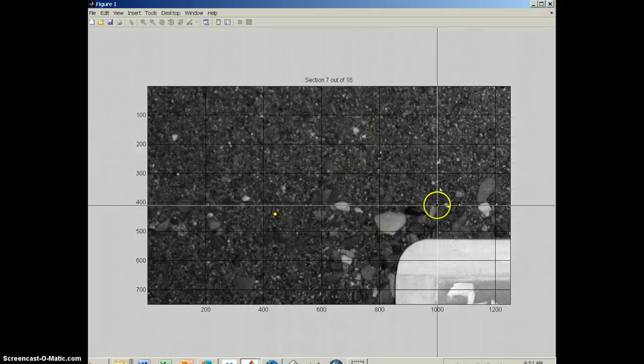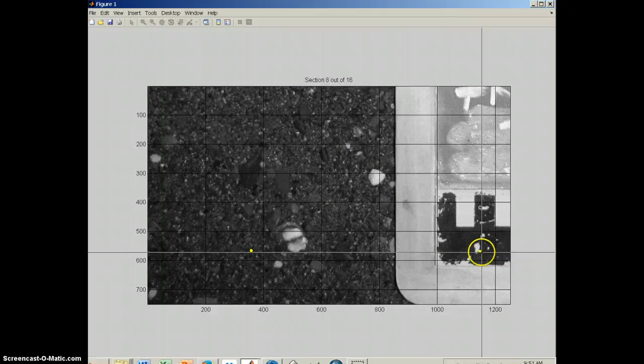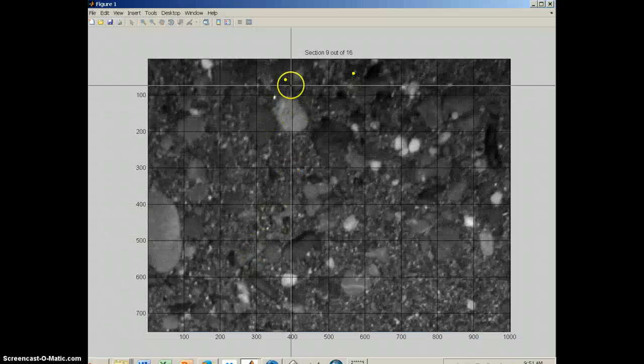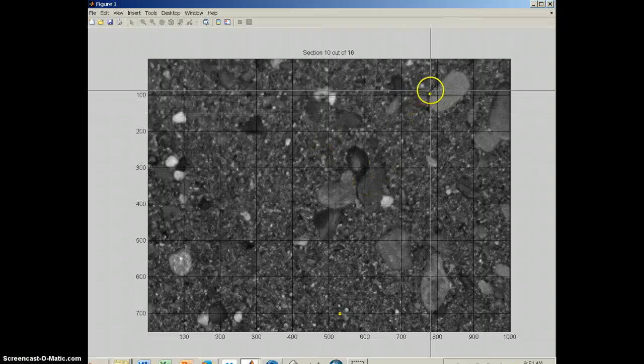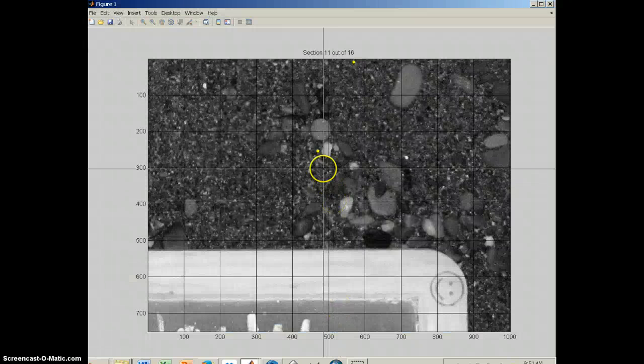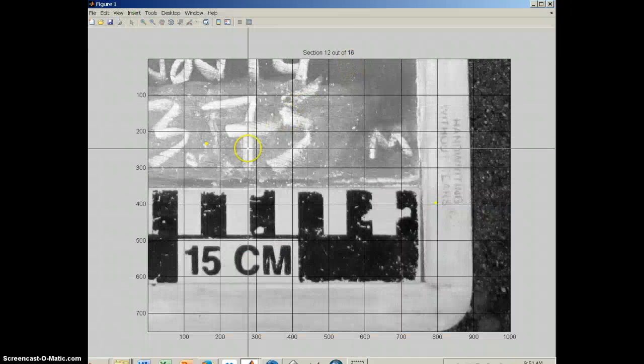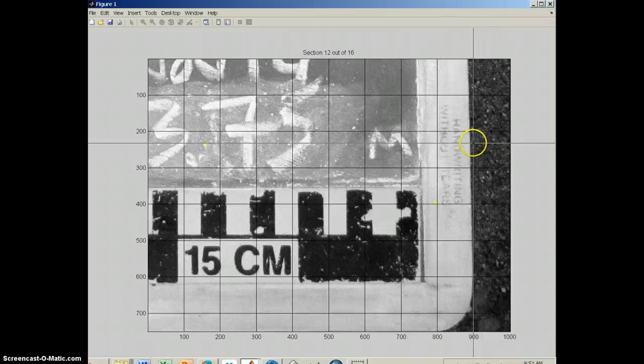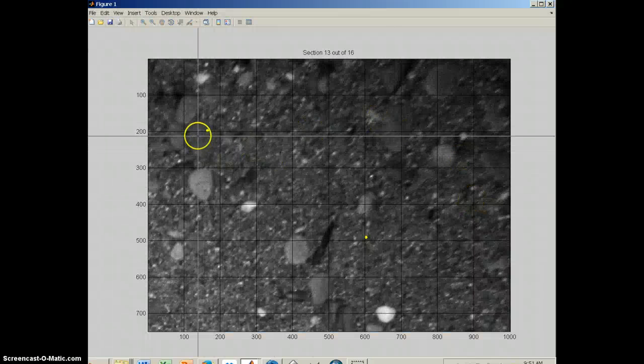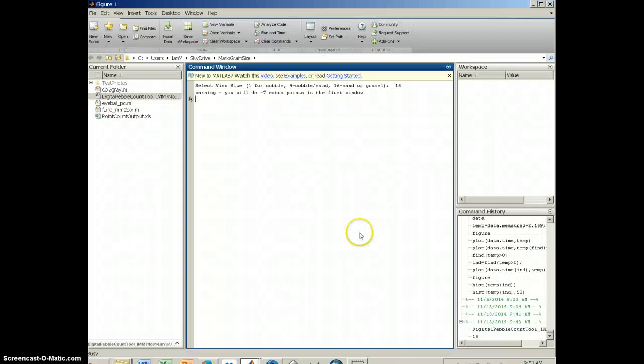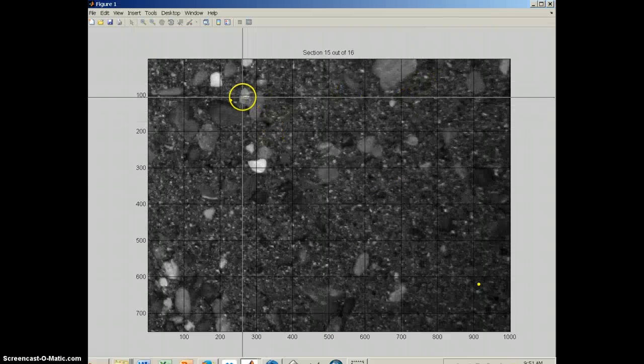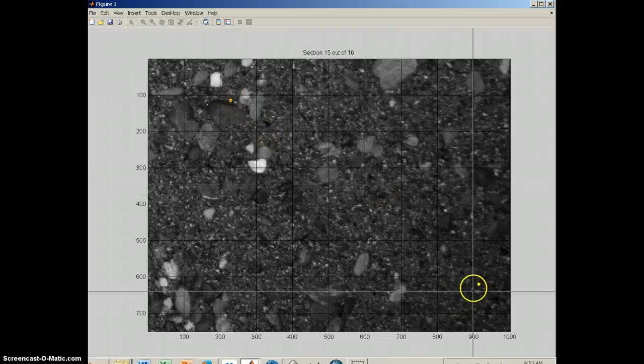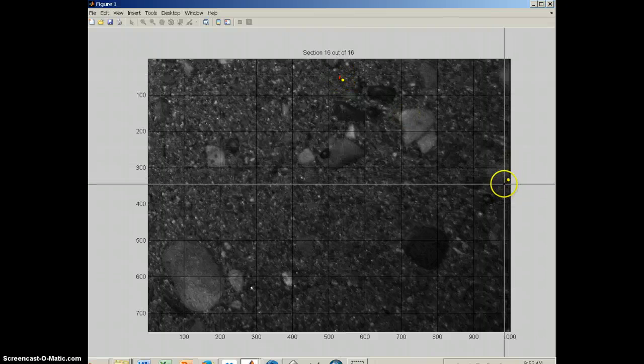You look for slight variability and contrast to find the edge of the photograph. So here's one that's falling on the edge, so I'm going to go straight over to the side. I'm going to do this grain. This one's a real small one. Here's one that falls on the board again, so I'm going to go straight over to the side. Another one falls on sand, so those are all quite small. It's a larger gravel. Okay, my last screen.